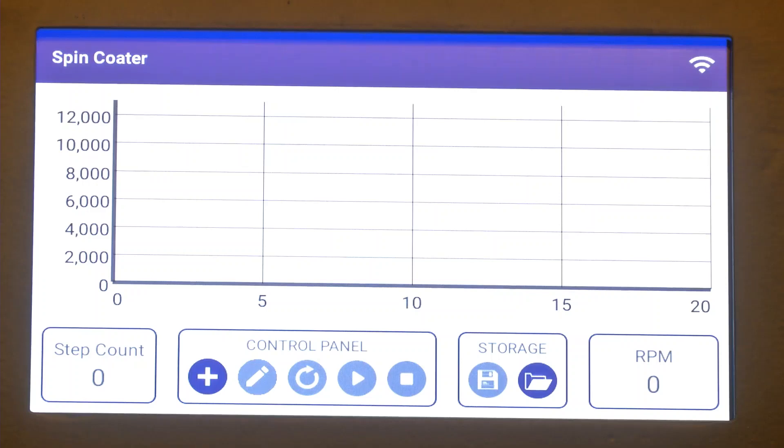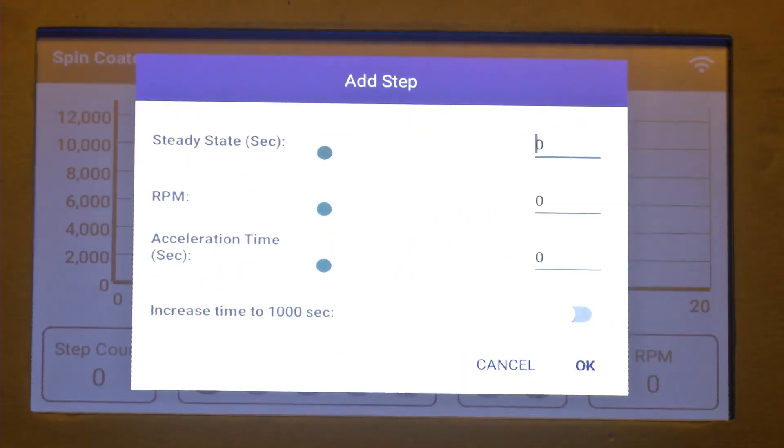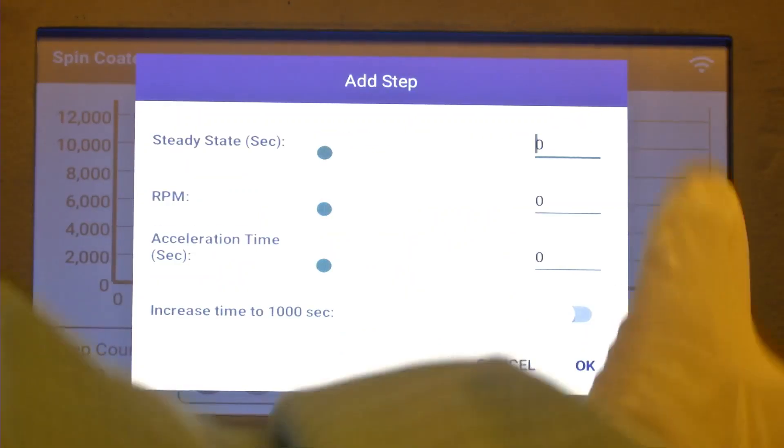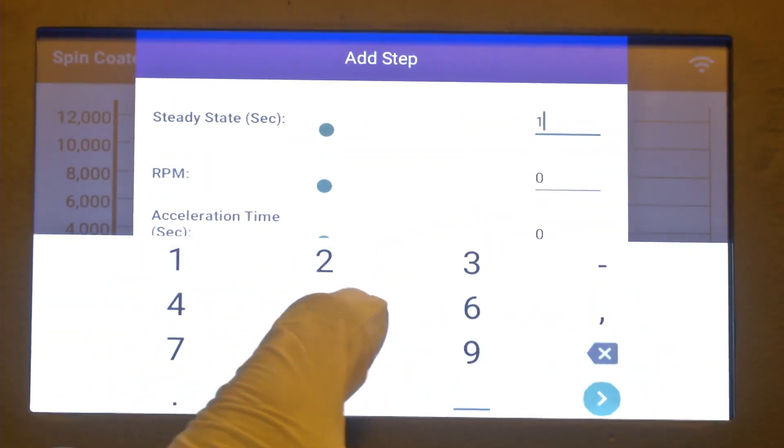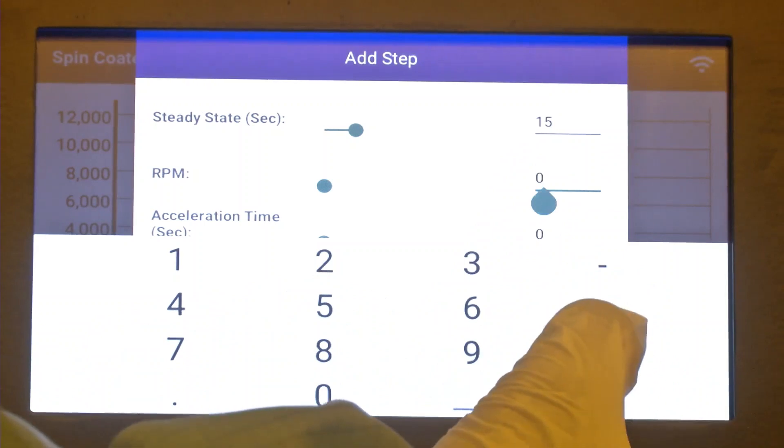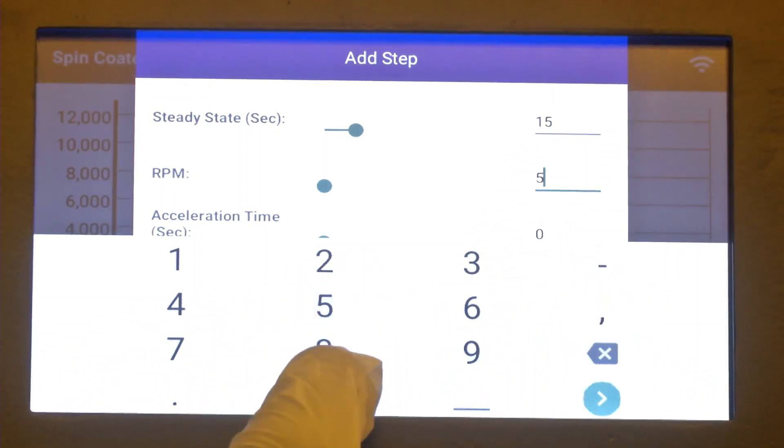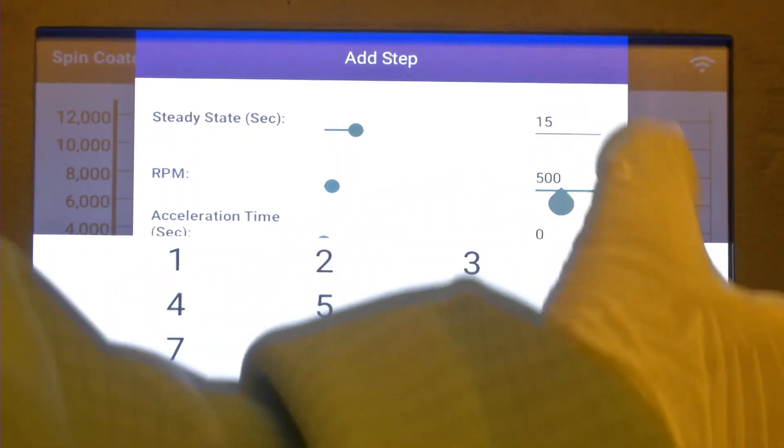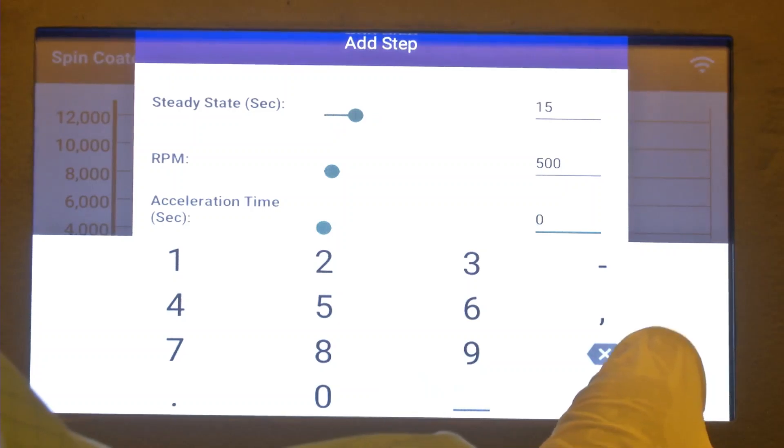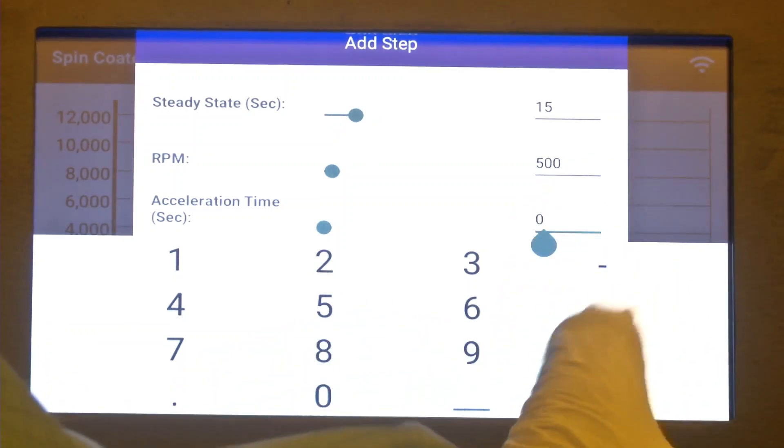Now we will see how we can program a spin coater. We need multiple steps for spin coating. Generally when we spin coat polymers or photoresist, we give two speeds. One speed is to spread the solvent along with the precursor, and the second speed is to dry off the solvent and thin it down. As of now we have given 15 seconds of rotation at 500 RPM for the first step. This will spread the precursor uniformly on the surface.